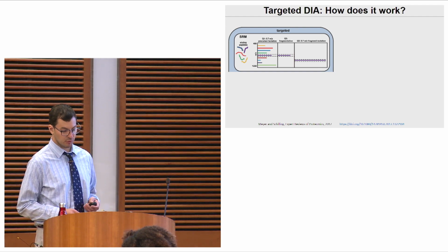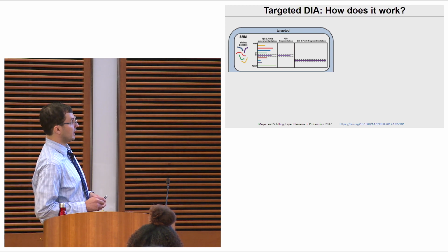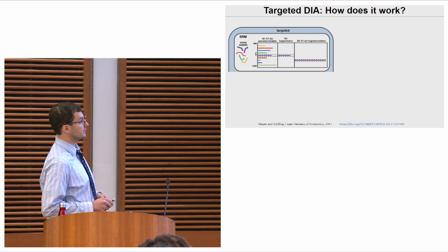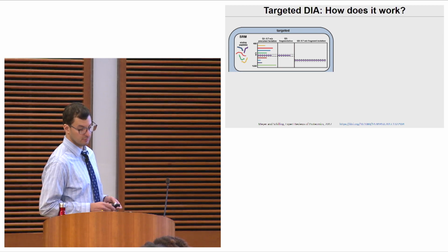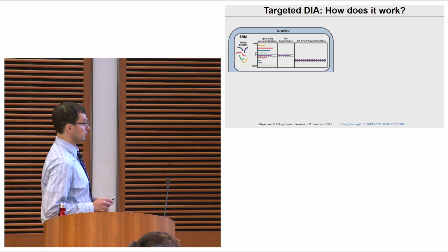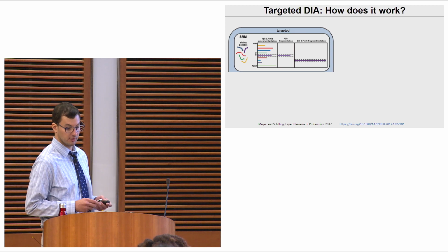In the simplest example of SRM, where you monitor just one peptide at a time, we use Q1 to constantly select its precursor mass throughout the elution gradient. And we use Q2 to constantly try and fragment that mass. And then Q3 is set to constantly try and monitor one of the fragments that are produced from that reaction. So the term reaction in selected reaction monitoring refers to the conversion of your precursor to your fragments. And selected means you're just monitoring one of those reactions.